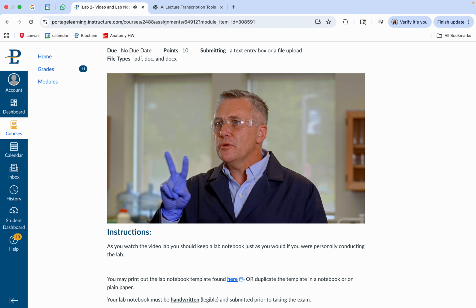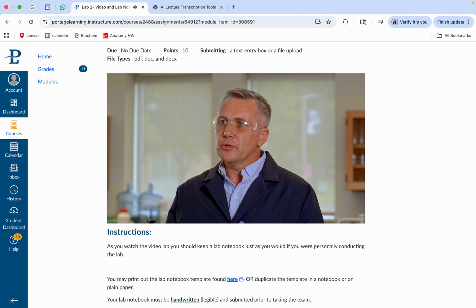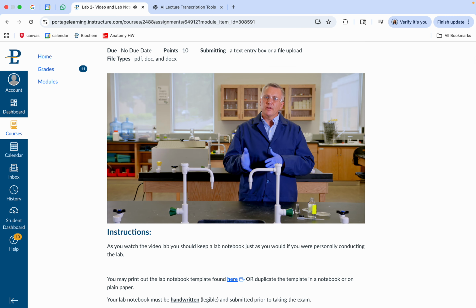We're going to look at the vapor pressure of two compounds, water and pentane. So we've seen those both already today, so we're going to compare their vapor pressures. We're going to do this by putting 2 drops of pentane on a watch glass. We're also going to put 2 drops of water on a watch glass. And we're going to think about how their intermolecular forces, pentane only has London forces, water has hydrogen bonds, impact their vapor pressure. All right, so the more molecules get into the vapor phase quicker, the higher the vapor pressure. If it takes longer, then that molecule would have a lower vapor pressure.